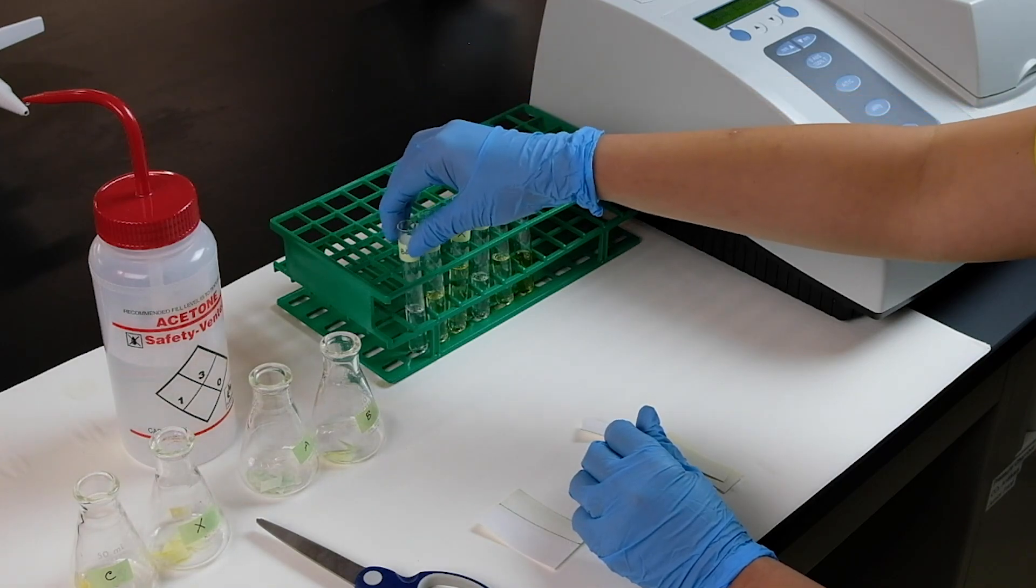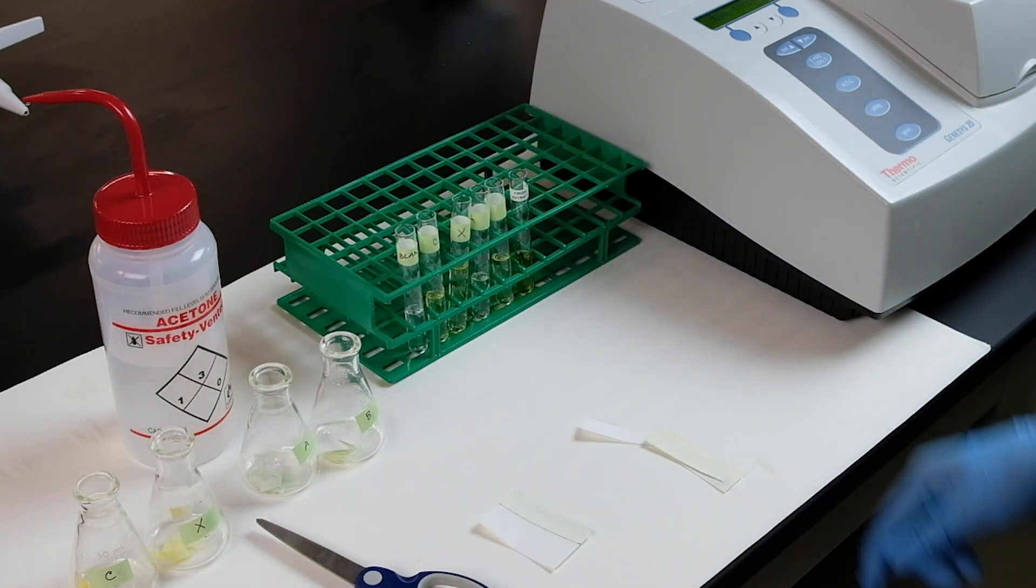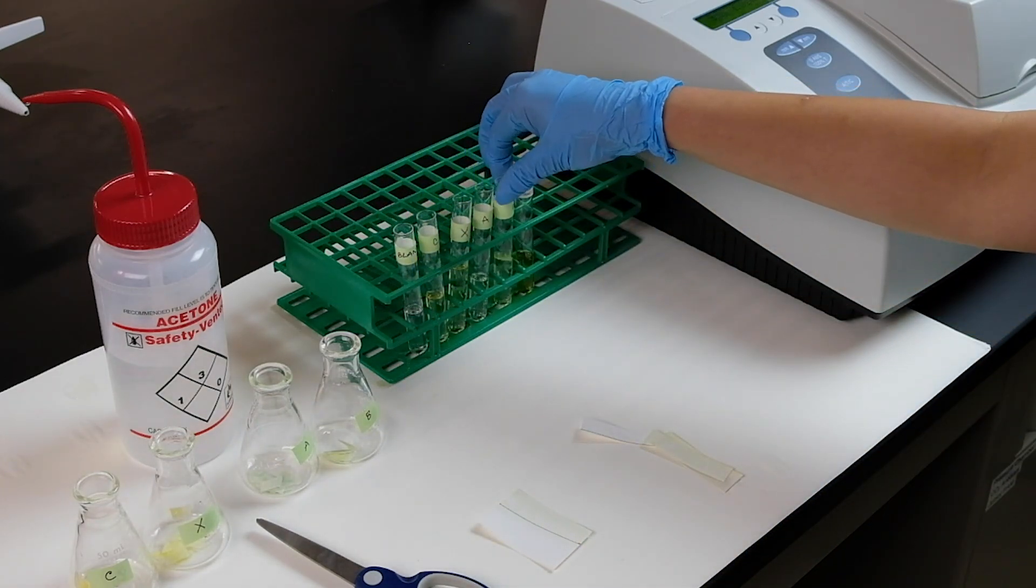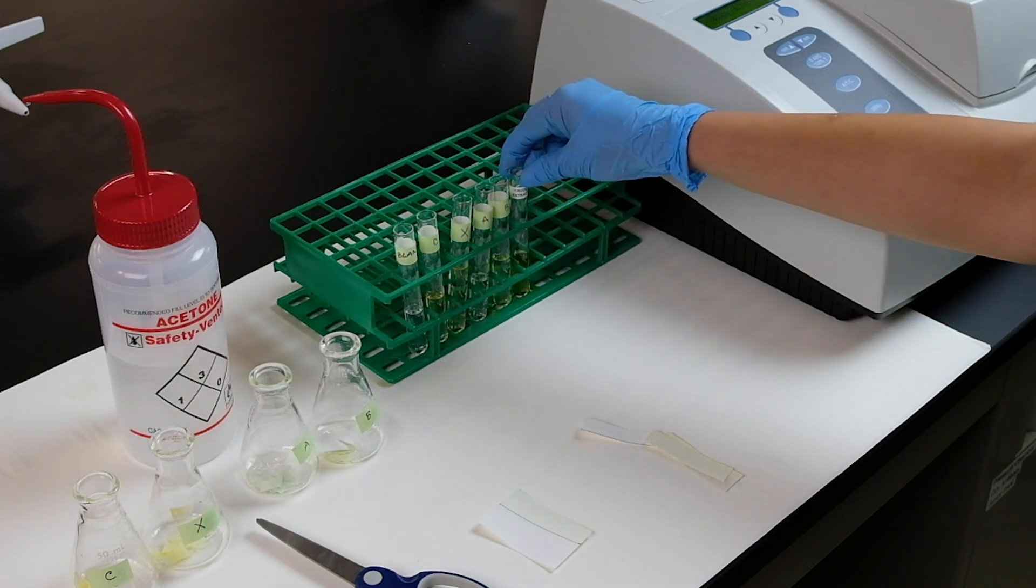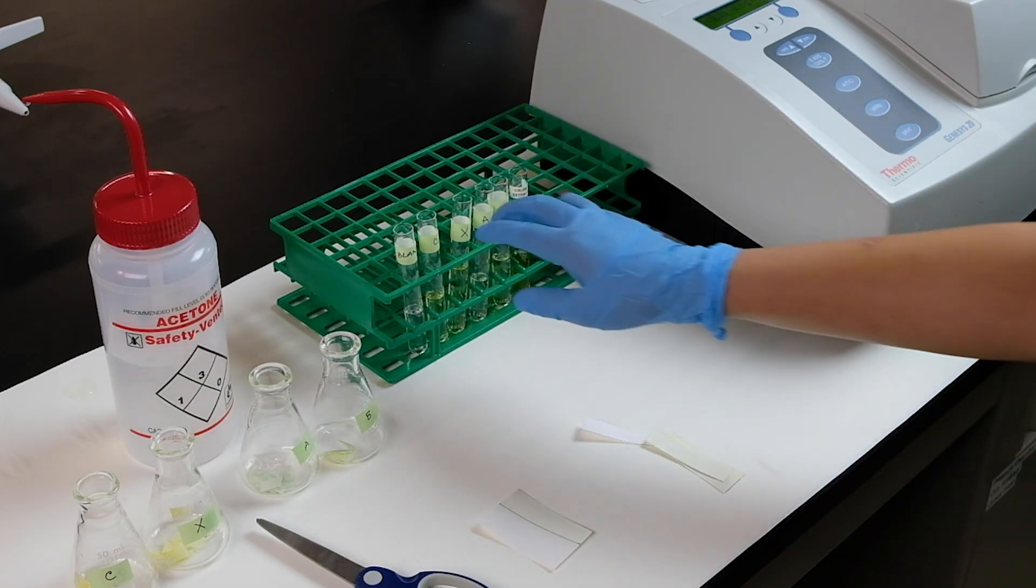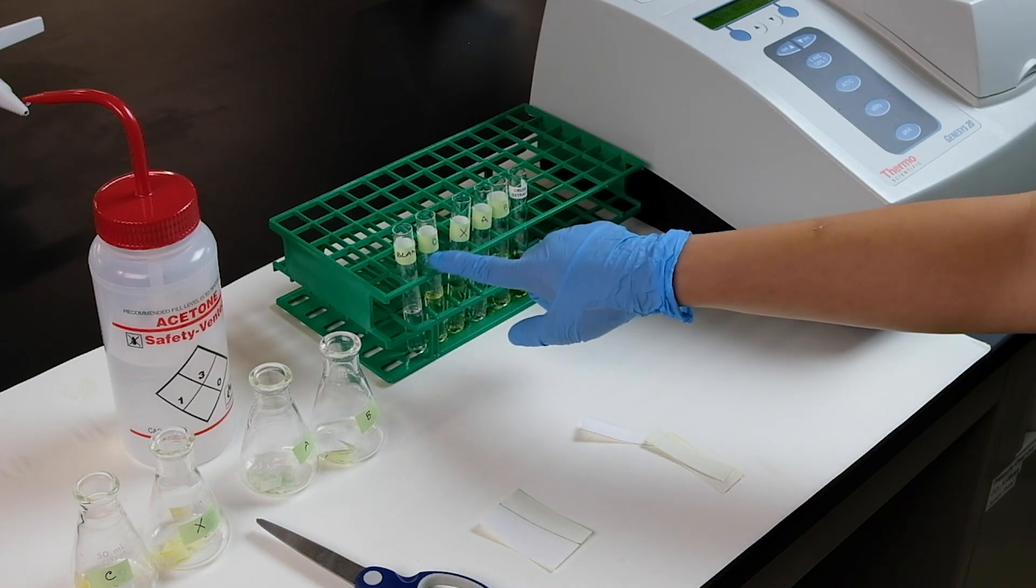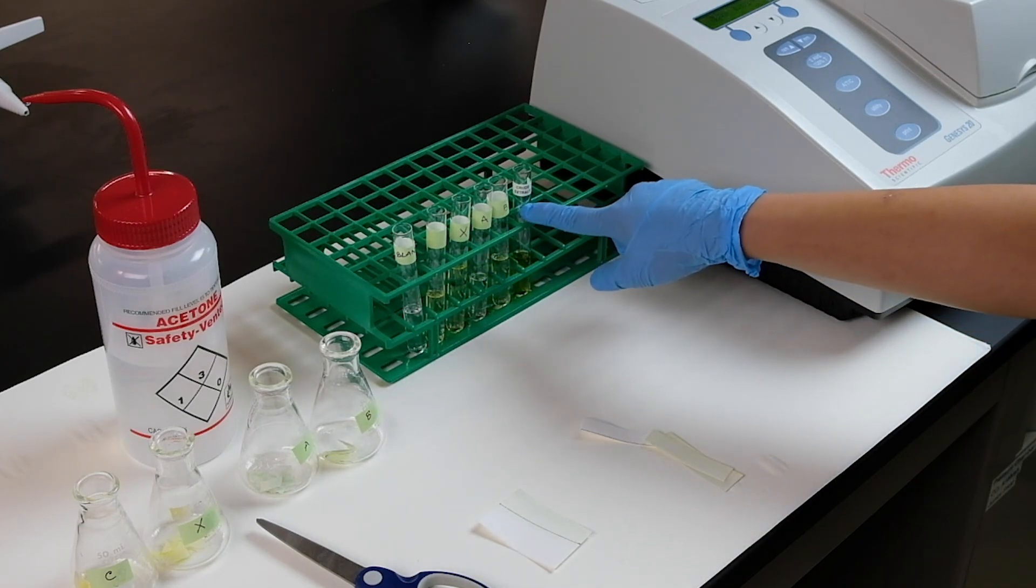At each wavelength, you would have six test tubes to read: the blank, four of your pigments, and the crude extract. But then, you only have five values: four pigments and crude extract.